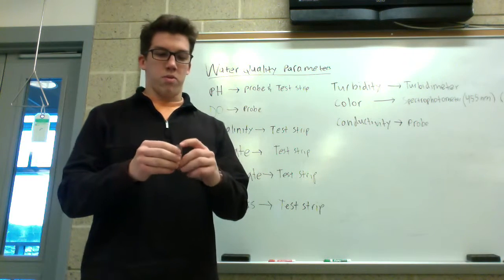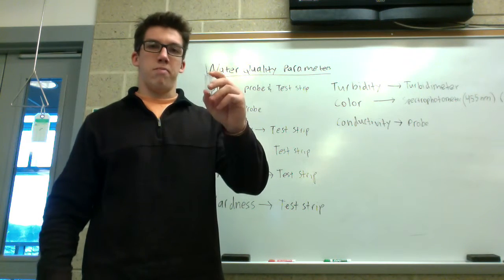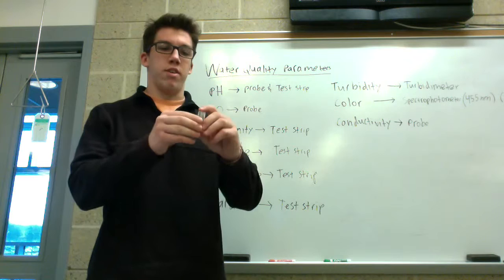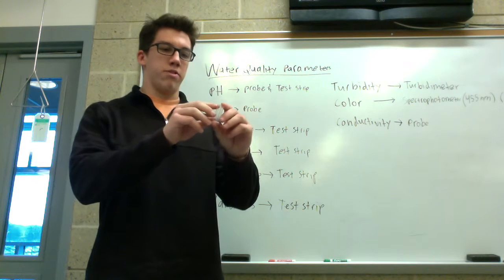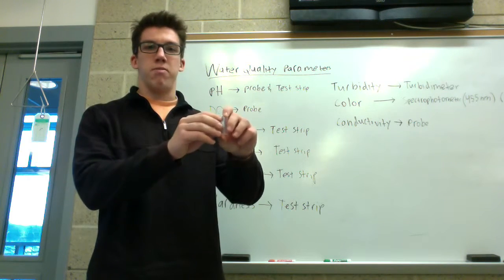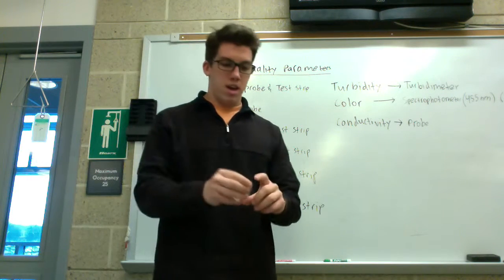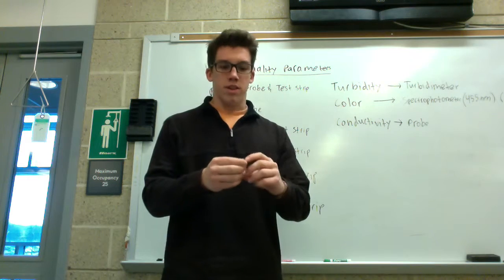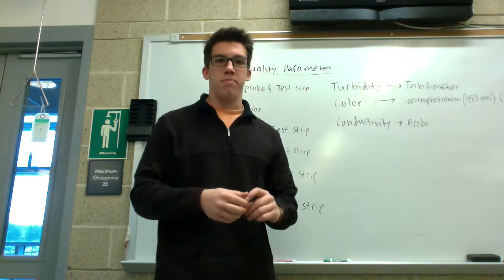We're going to put water inside this little vial and place it into the spectrophotometer. There's a little V-shaped line on the vial that should be facing towards you when you put it in. Give it a little while and then you'll get a color value.